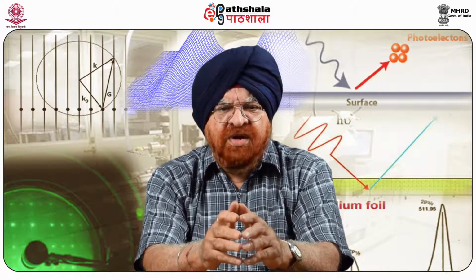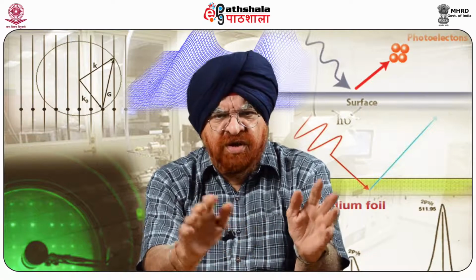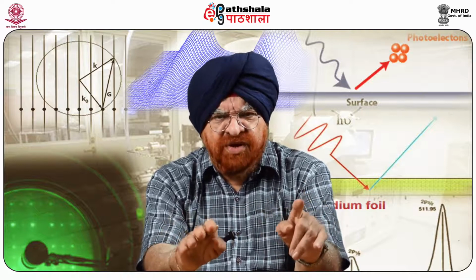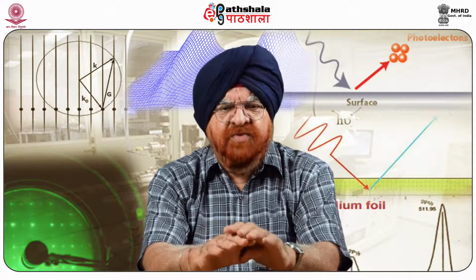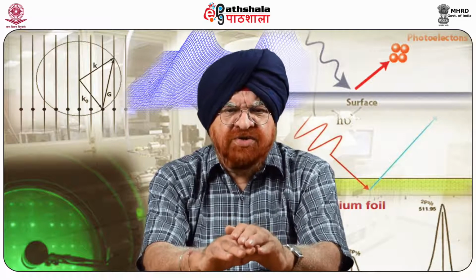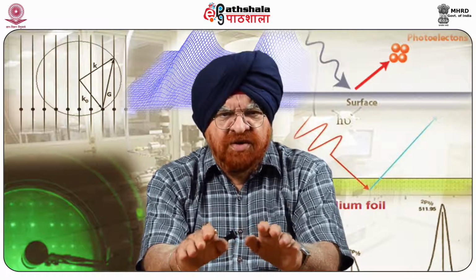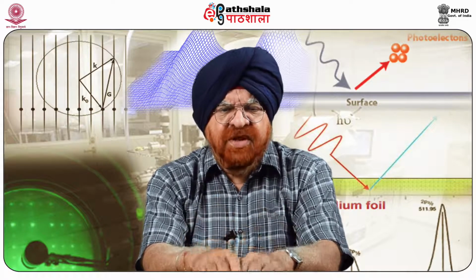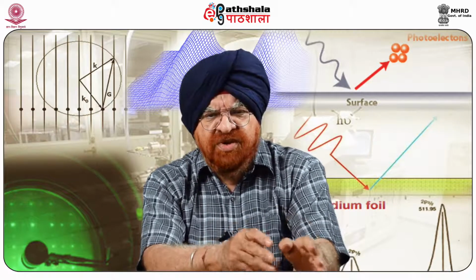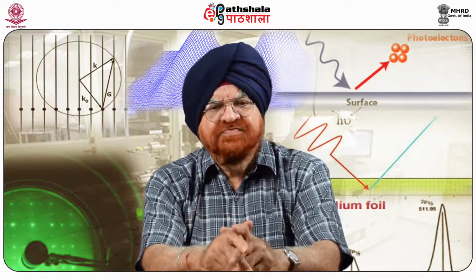Contact angle, titration, and streaming potential measurements provided general information about the surface chemistry and the potential variation, which largely complemented the CFM analysis, but could not match the accuracy of CFM at the atomic level. Using CFM, it was found that both membranes were chemically heterogeneous.